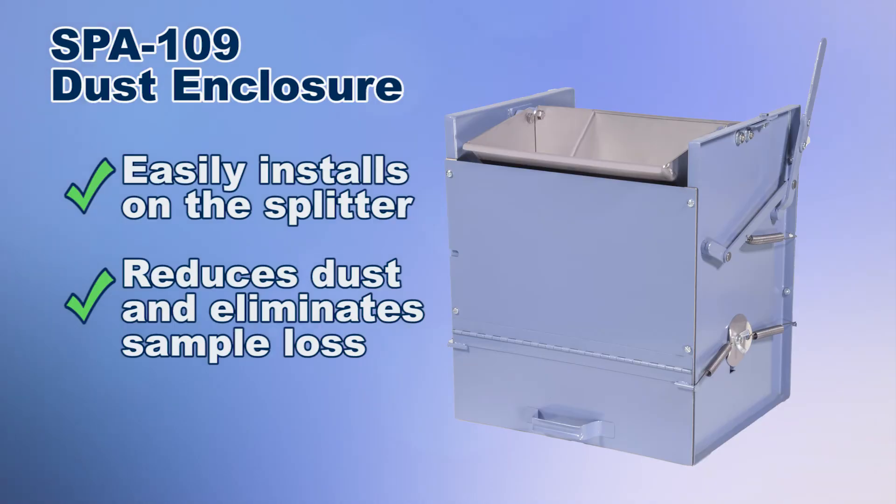The optional SPA 109 dust enclosure accessory installs effortlessly and has hinged flaps that lock into position for easy pan access.